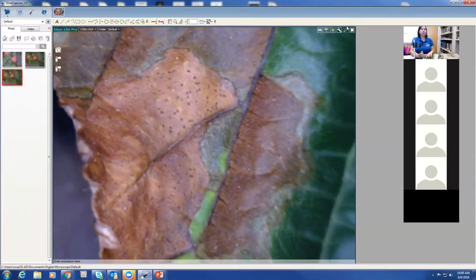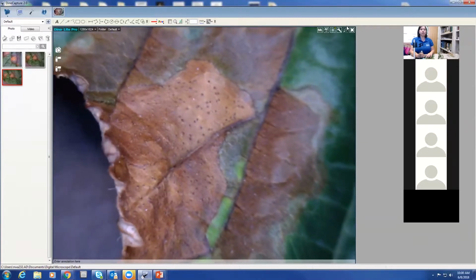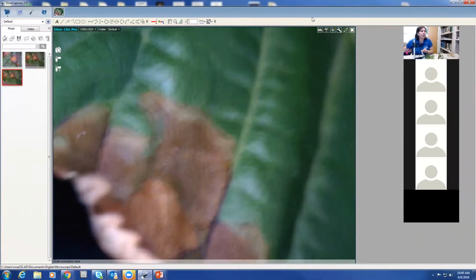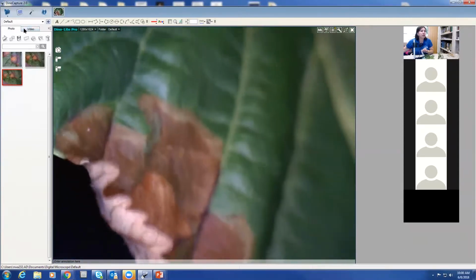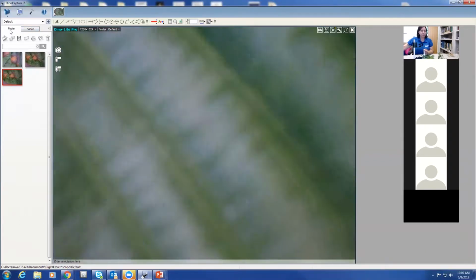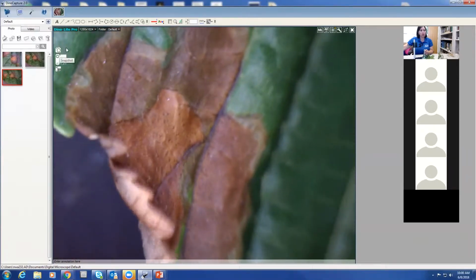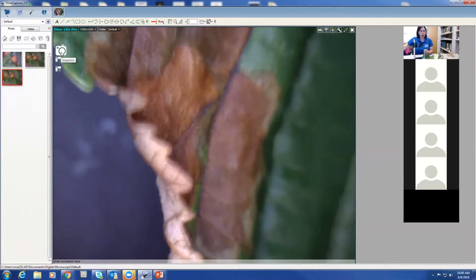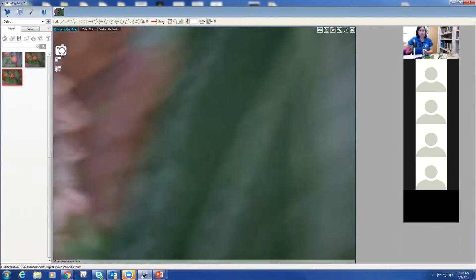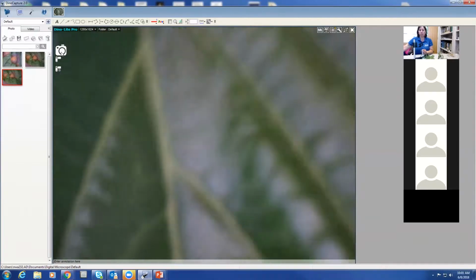As you can see, we're coming in and out. So if you were having a conversation with me, we could definitely do this live. You could video it. Let's see if I can get to the top here. You see video right here. Okay, video is going to let you video record something, or photo, which is the tab that I am on. You're going to go here and you can either click this photo button here if you want, or you can touch the button on the side of the actual DinoLite while you're holding it. All right, if you want to take a picture, it's very hard to steady at this point. As you can see, I'm shaking.